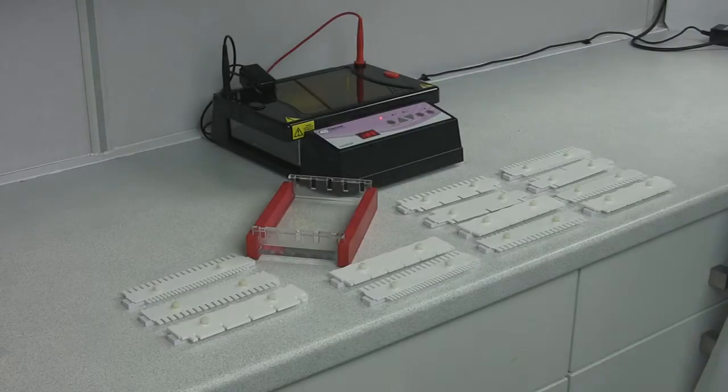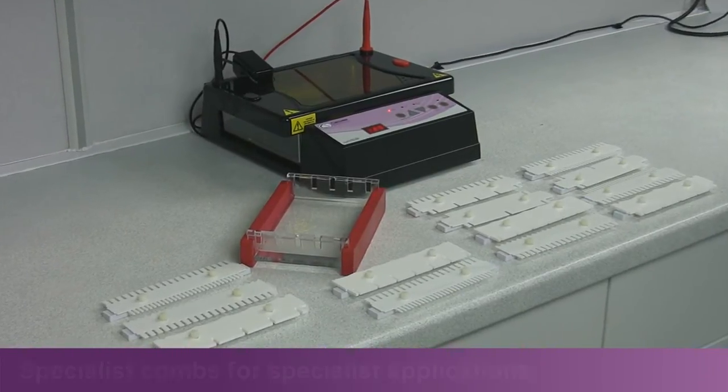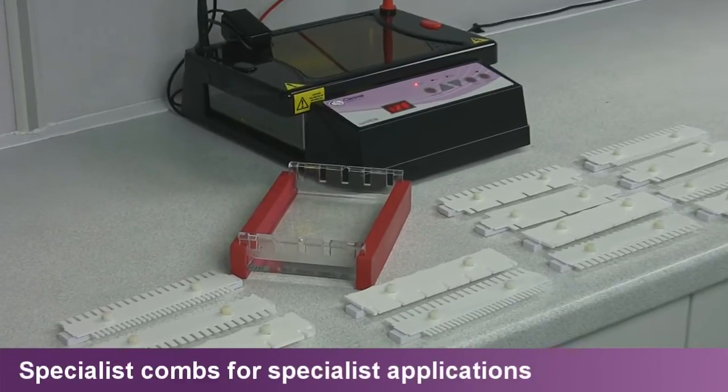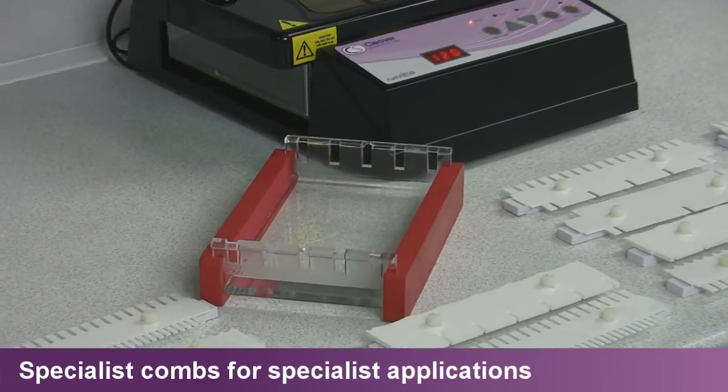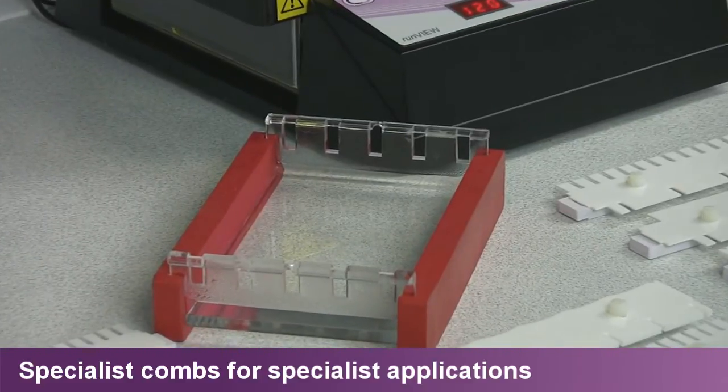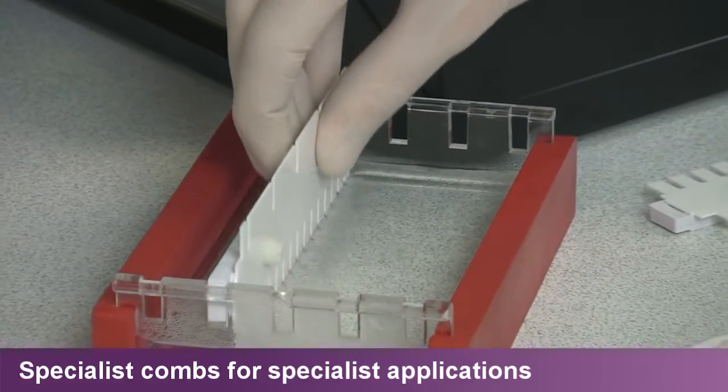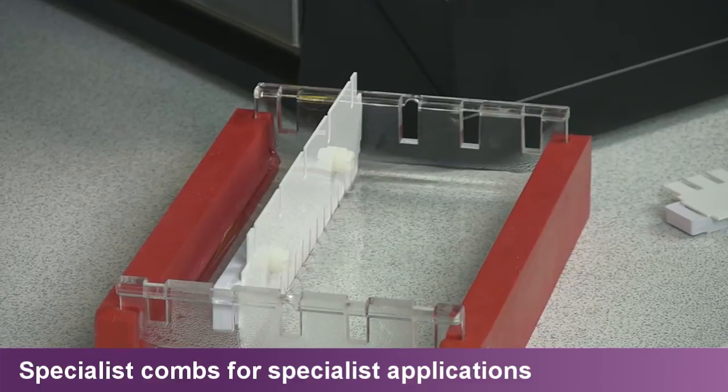RunView includes extra thick double-sided combs for gel-free recovery of DNA and multi-channel compatible combs for rapid screening of nucleic acids from thermal cycloblocks and microtiter plates. Standard combs are also supplied.